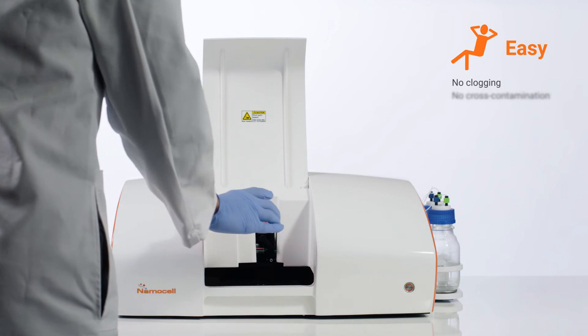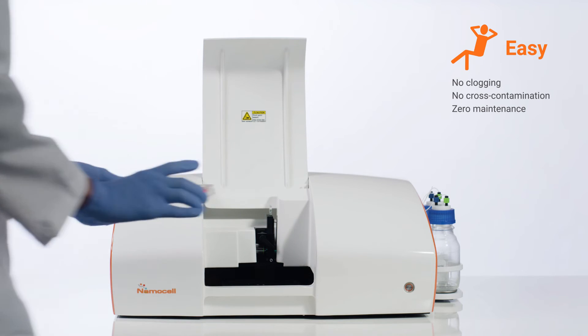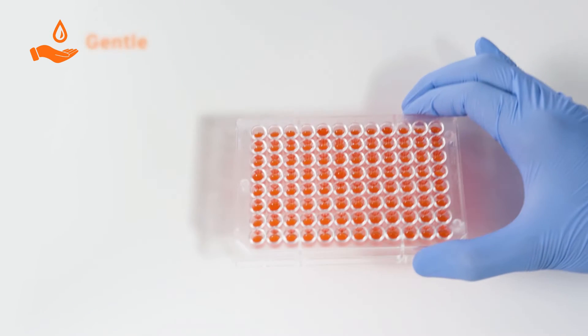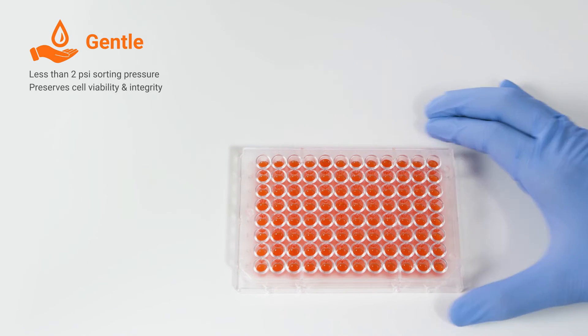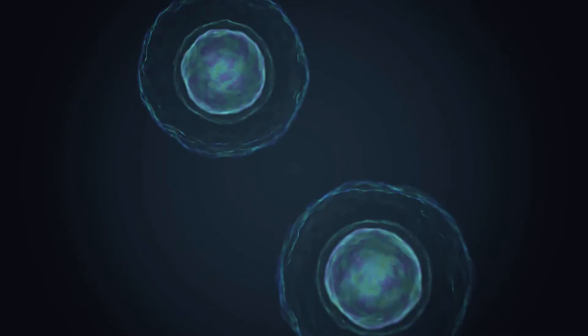With no clogging, no cross-contamination, zero maintenance, and effortless sterile sorting, the Pala is an easy and worry-free instrument designed for every lab. With a low sorting pressure less than 2 PSI, the Pala will preserve the viability and integrity of your cells.